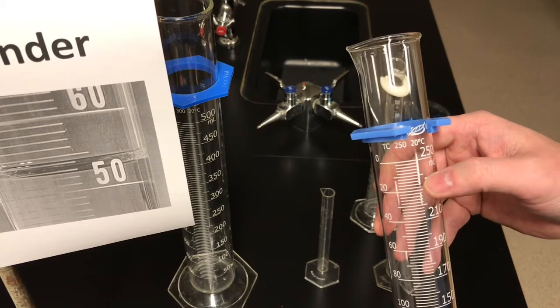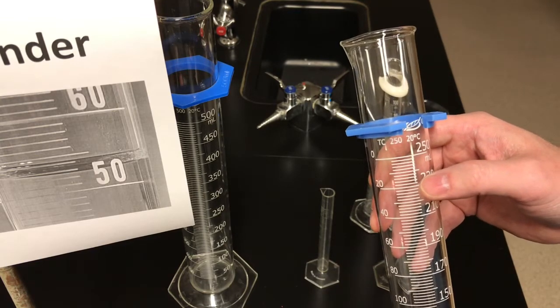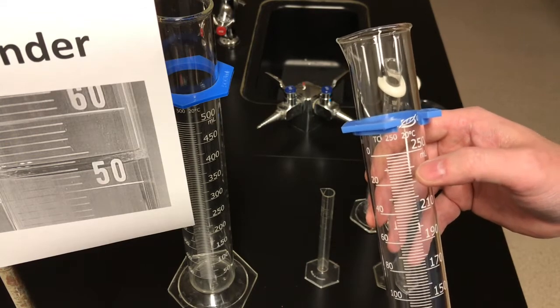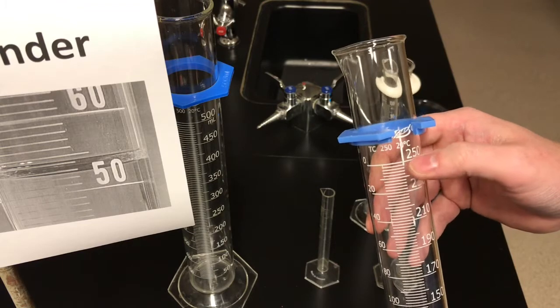So each of those tick marks is 2 milliliters. Counting through: 230, 232, 234, 236, 238, 240 — a slightly longer one in the middle — and then you keep counting up to 250.